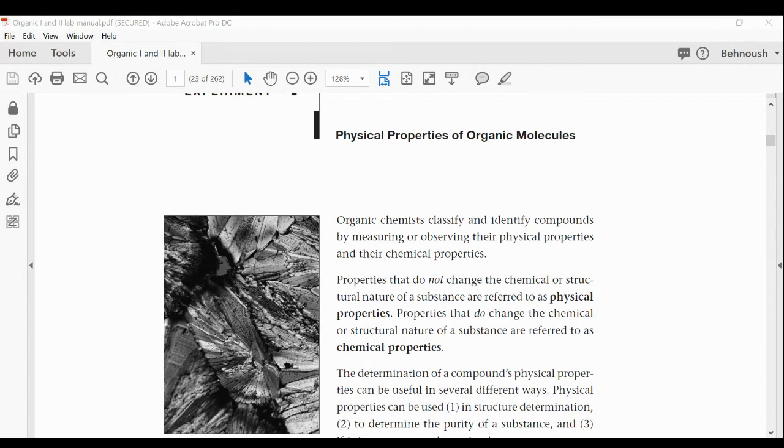be able to tell me anything about mixed melting? When is it used and what does it mean? Mixed melting point. Have you heard the term mixed melting point? Is the mixed melting point just when it's an impure compound and it causes the melting point to be lower because there's two substances?